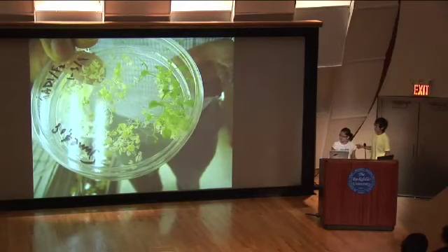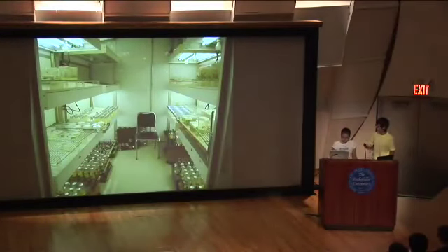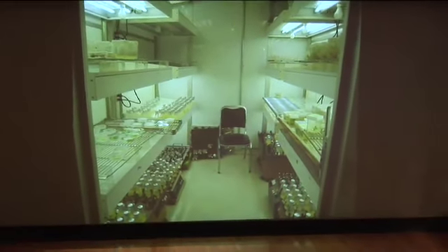These are pictures of different samples he showed us. That's the agar plate, and those are the plants. You can see there are a lot of shoots here, and not so many shoots there. After you've done that, you place it on the agar plate and all you need to do is give it some sunlight. This was actually in constant motion, which is why there was that mushy, massive growth of plant cells. Over there are the normal plates.